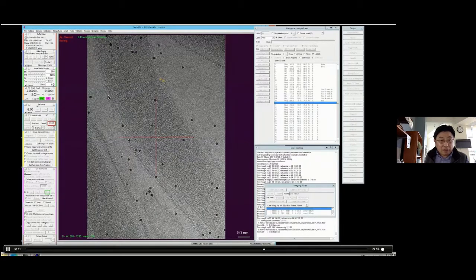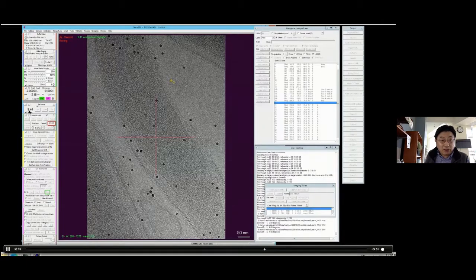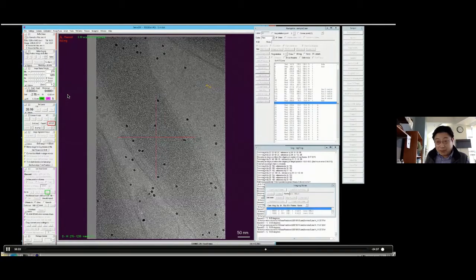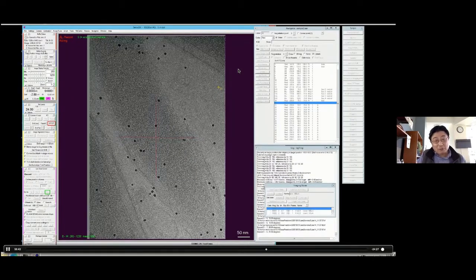Then from now on, they become very fast because now they collect 6 degree, 9 degree, and 12 degree. Switching between different mags takes a lot of time for the lens to normalize, but once they start to collect data, it becomes very fast. So this is basically connected to the beginning. It's basically doing the same thing. It's very boring, as you already noticed.